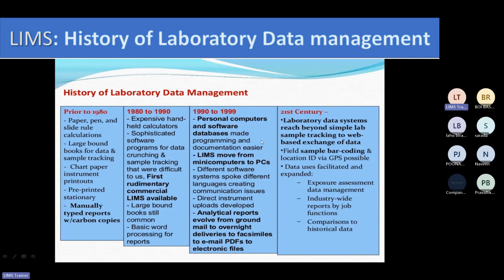And how does this work? It works with projects. Some IT industries take the project of some pharma industries, clinical trial industries, hospitals, or private labs, and they develop this particular software for that laboratory and sell it. Here, the person who has knowledge of the software and also the end user experience is a good asset for that particular project. So there is a big opportunity if you have knowledge of the software.